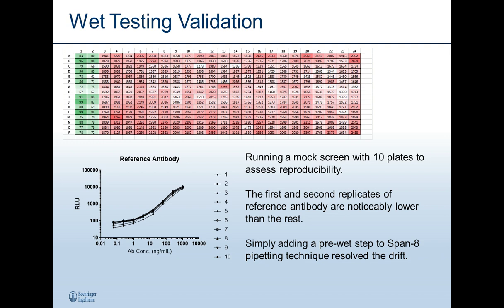But as an example here, I did a wet test validation of this MSD platform, and I ran a mock screen with 10 plates to assess reproducibility. The first and second column were background samples.